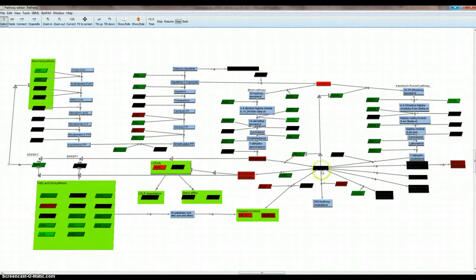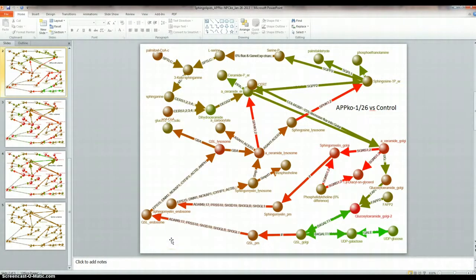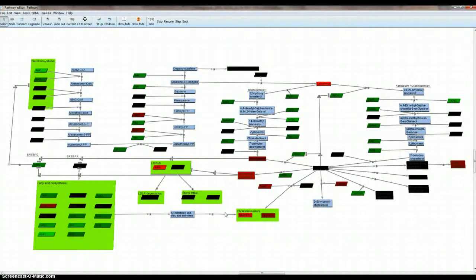So, how do you correlate these and think about flux through there? What changes in flux account for all of these shifts when gene expressions are mostly going down? A few up over here, sterol going up, and everything around it is either no change or green. But this is the way that we would want to be able to analyze these types of things. So in the end, is this easier to analyze than this type of a system here? Okay, I'd click pause there somehow.